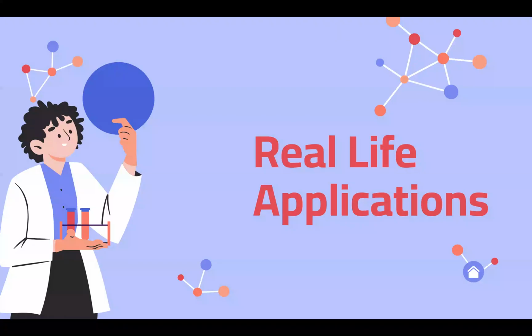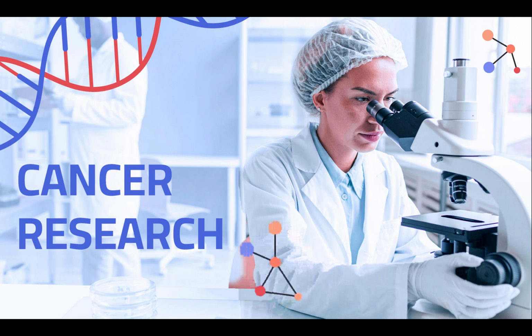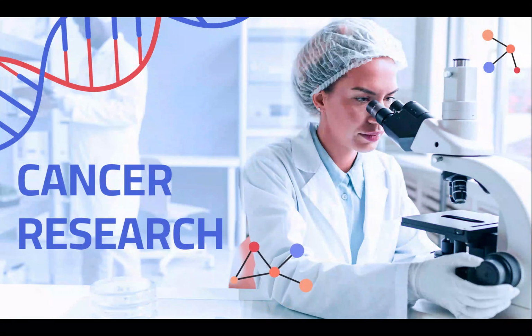There are endless amounts of experiments and studies that have RT-PCR incorporated within them. Today, I will focus on two real-life applications of RT-PCR. One real-life application of RT-PCR is in cancer research. There was a study conducted in 1996 where RT-PCR was being tested as to whether or not it is a useful technique in being able to express and detect certain proteins that are correlated to tumors. It was concluded that RT-PCR was a sensitive method for detecting these cells and it causes less contamination between samples.